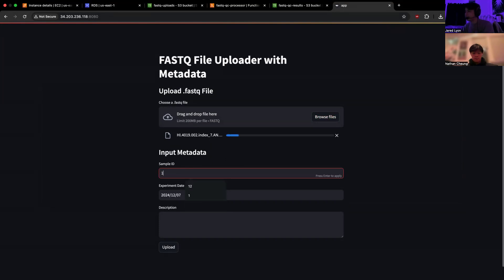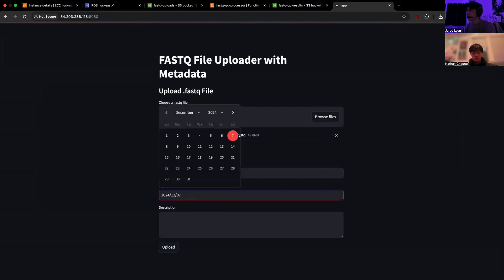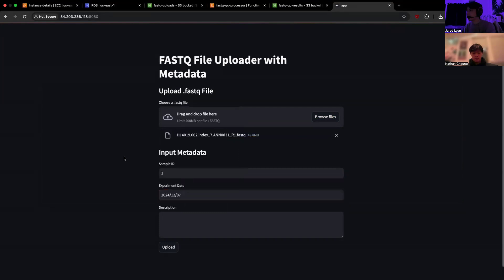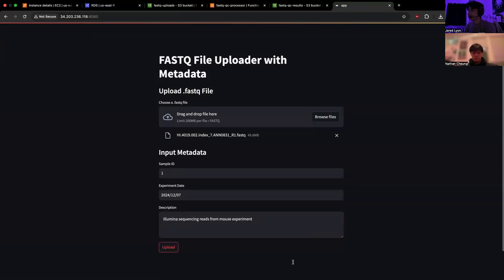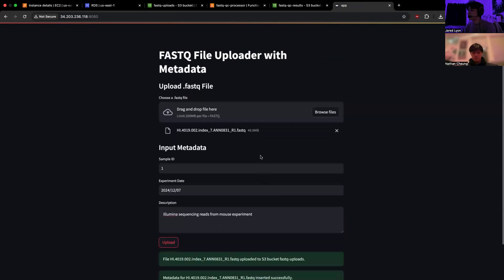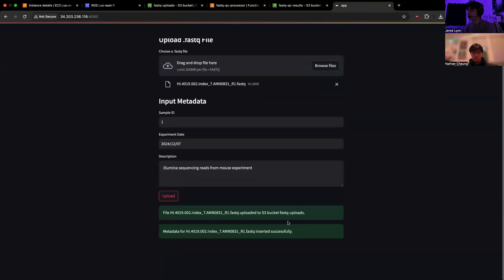In the meantime, we can call the sample ID 1, because this is our first upload. The experiment date is today. And then our description will be Illumina sequencing reads from mouse experiments. And then we go ahead and click Upload. And then we get our confirmation messages right down there.